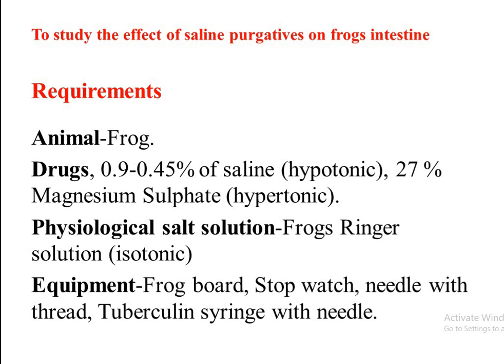Right? So the student can also add one more thing: they can add images of the compartments representing the different compartments. Right? So this is all about the study of the effect of saline purgative on frog intestine.